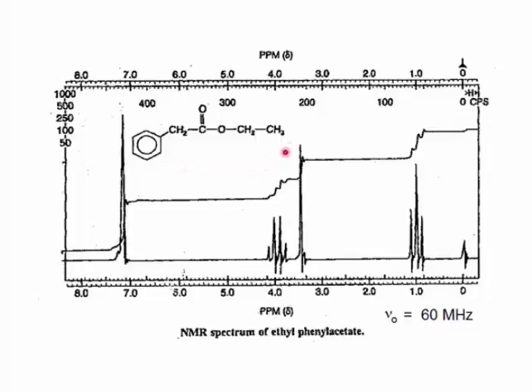Let's return to the methyl here and decide how many peaks there will be in its multiplet. To do that, we use the n+1 rule. This methyl group is attached to methylene. These two methylene hydrogens are neighboring hydrogens to the methyl. These two methylene hydrogens comprise a set of two equivalent neighboring protons with respect to the methyl signal proton. So how many peaks are going to occur in the methyl's multiplet? Well, use the n+1 rule. N here is the number of equivalent neighboring protons, which would be 2. We add 1 to that, and we get 3. Indeed, we predict a triplet, and we see the triplet here. And that confirms our assessment that this signal is due to this methyl.